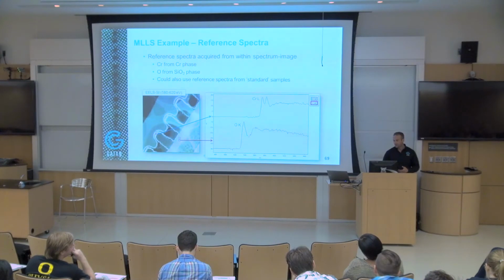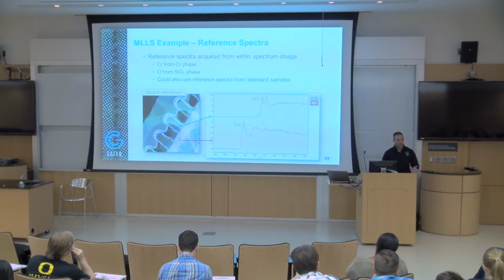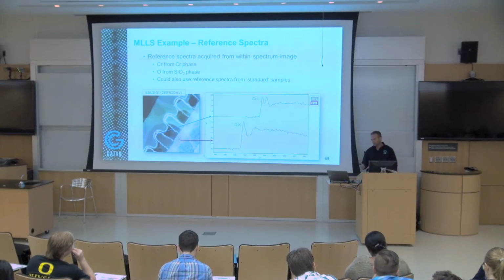But the problem is that you have to make sure they're giving you the right conditions, such as the collection angle. Accelerating voltage is not a problem because I don't think you can make a mistake on that, but the collection angle can be a problem. Once we have accurate information, we can scale or recalibrate based on the conditions in which you want to use this particular standard spectrum. That is the short-term idea, I think.